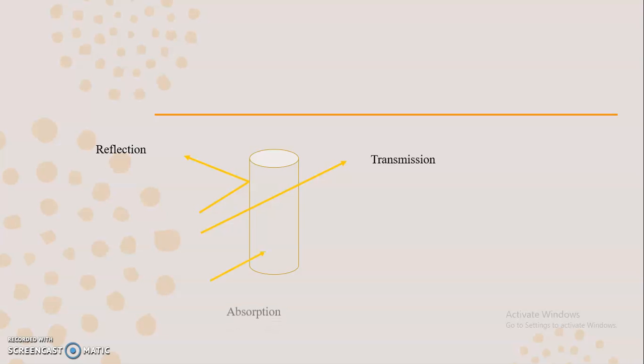Then part of the light is absorbed, means the solute molecules that are present will absorb some amount of light, and part of the light may be scattered, means deviation in the angle of the incident light takes place, which is known as scattering. In case of transmittance, the light that is falling will transmit as such. But here the angle of incident light is changed.